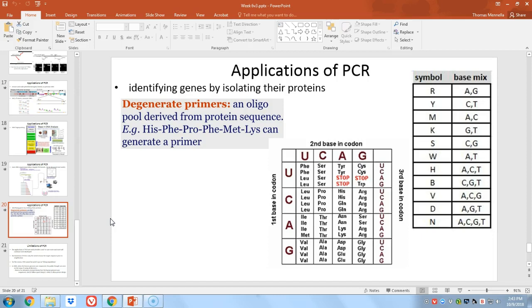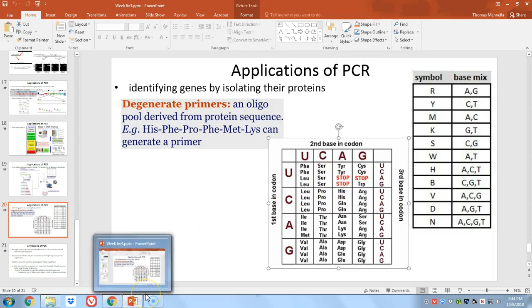And we go into this knowing that if histidine is the first amino acid of the protein, the first amino acid we're targeting with our primer at least, we don't know exactly what codon is in our target gene for histidine, because again, we don't know the sequence. But we do know that histidine is encoded by one of 2 different codons, either C, A, U, or T in this case, or C, A, C. So we're going to design our primer to capture both of those.